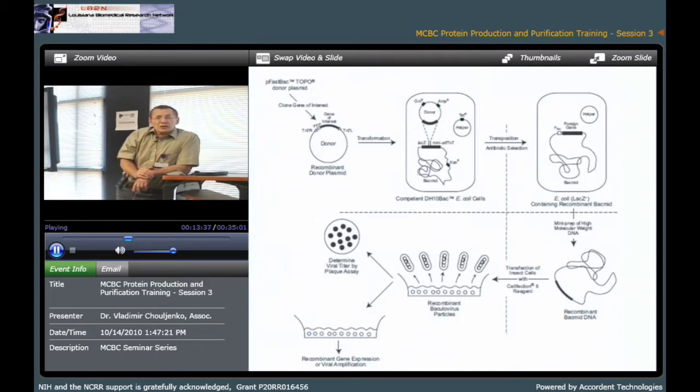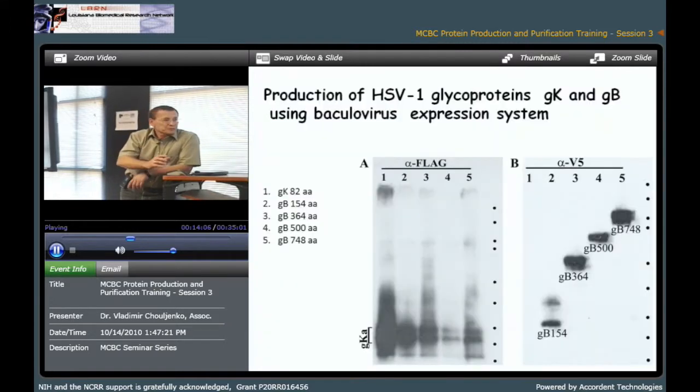You can use a regular incubator, and for suspension culture, at least in our lab, we are using a regular shaker, not even special equipment, just regular flasks with RPM somewhere between 125 to 150, and it works just fine. When I called companies, they even suggested to do it this way instead of those pictures which Dr. Kasulas was showing before.